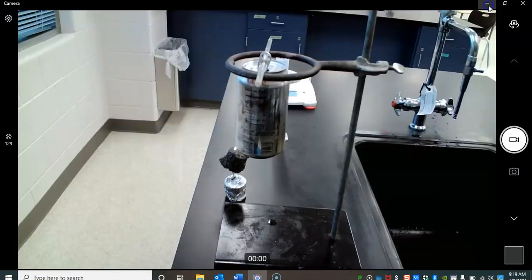So remember, as you're working through this, that what we're really calculating is the calories in the food. So things that are more caloric would cause a greater rise in temperature, and things that have fewer calories would cause less of a rise in temperature. All right, so just let me know if you have any questions while you're working through this.